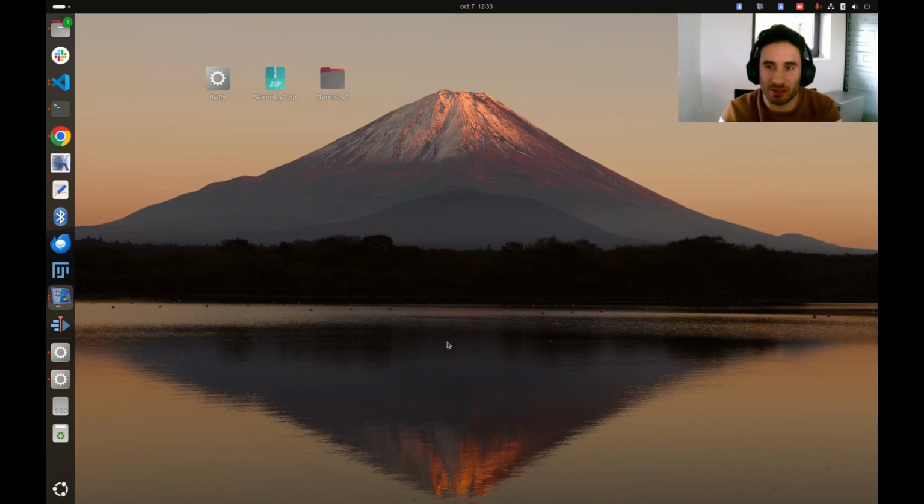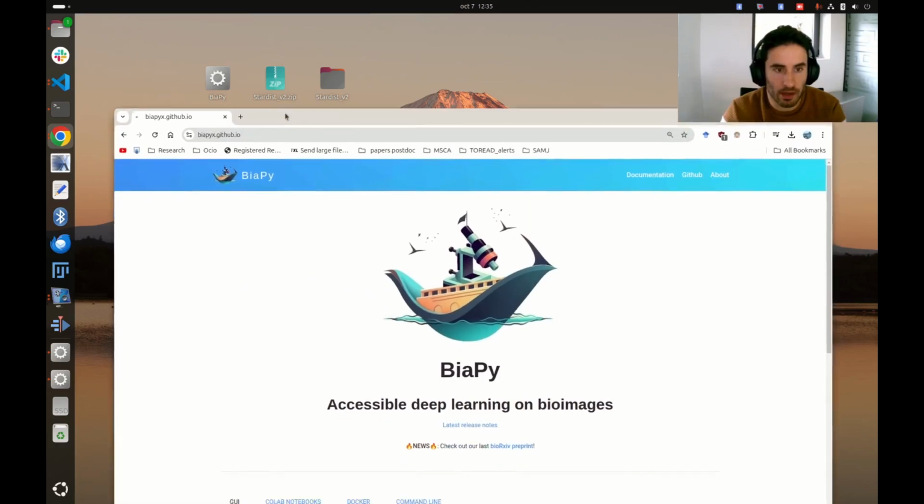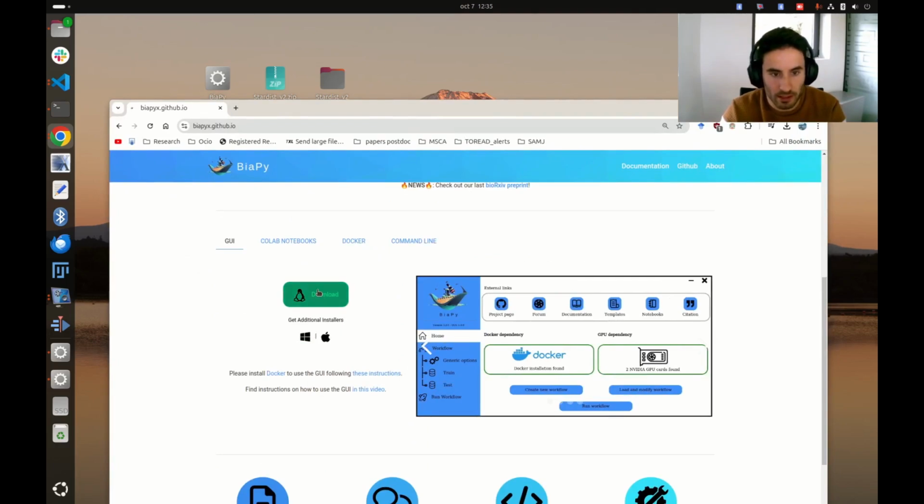Hello everyone, so today in this video I'm going to show you how you can run an instance segmentation workflow using BiaPy graphical user interface. Okay, so here in this video we will need a few things. The first one is BiaPy graphical user interface binary. Okay, so if you go to our landing page, you can download it clicking on this button.